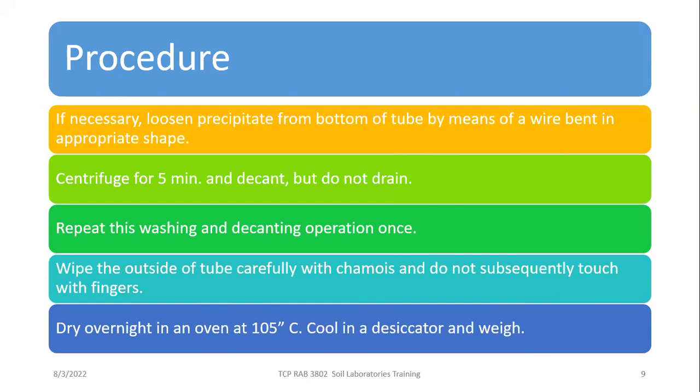So it will be helpful if there is no spectrometer to be used, but if there is a spectrometer, I think the other one is suitable, using the spectroscopic methodology used in your laboratory in Lebanon, especially for water analysis, determination of sulfate in water.